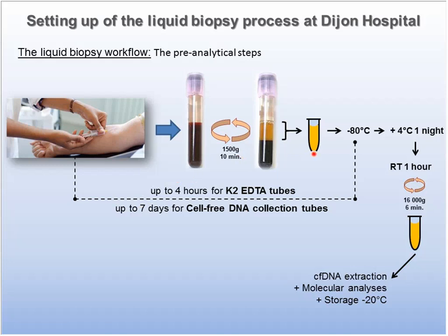The first is to isolate the plasma. As I said before, just after this isolation, we put some plasma samples at -80 degrees.